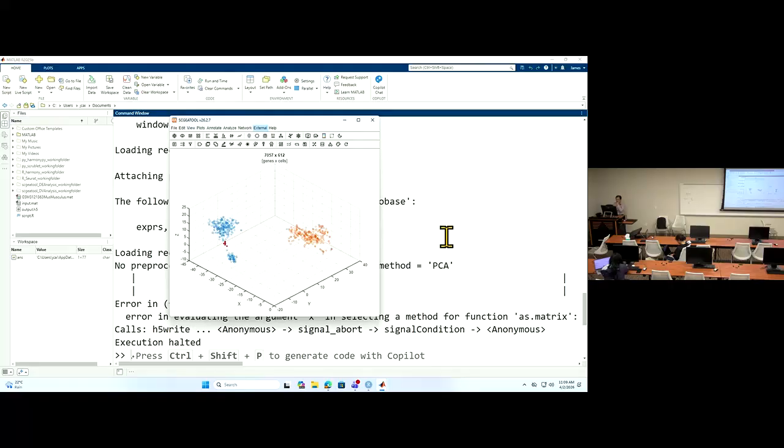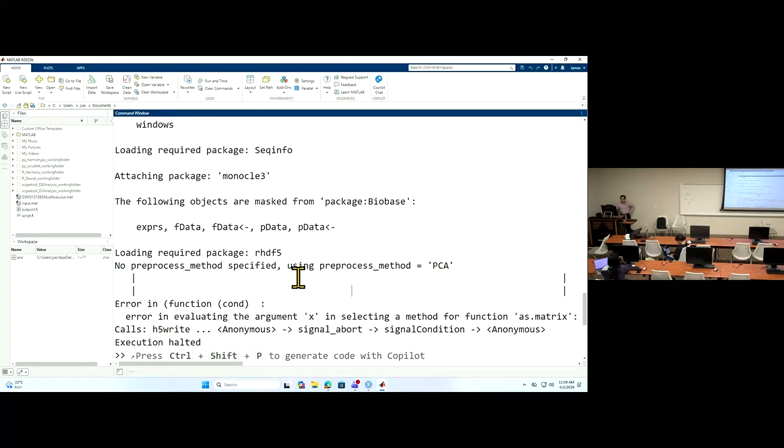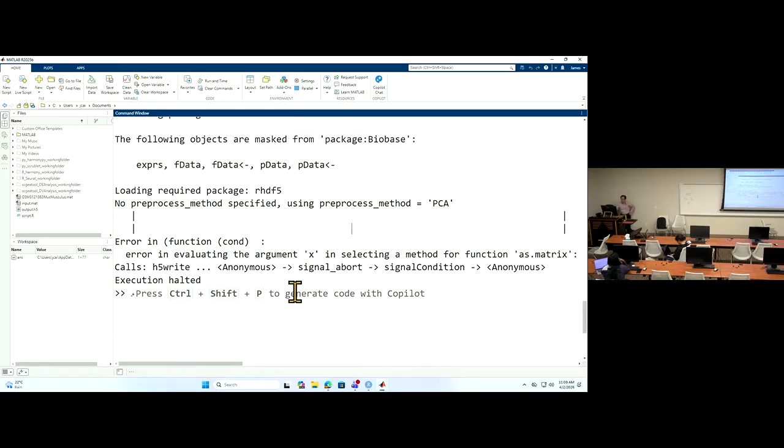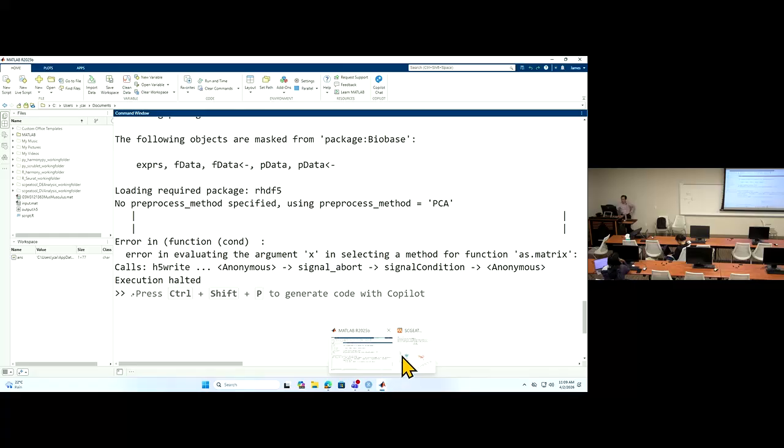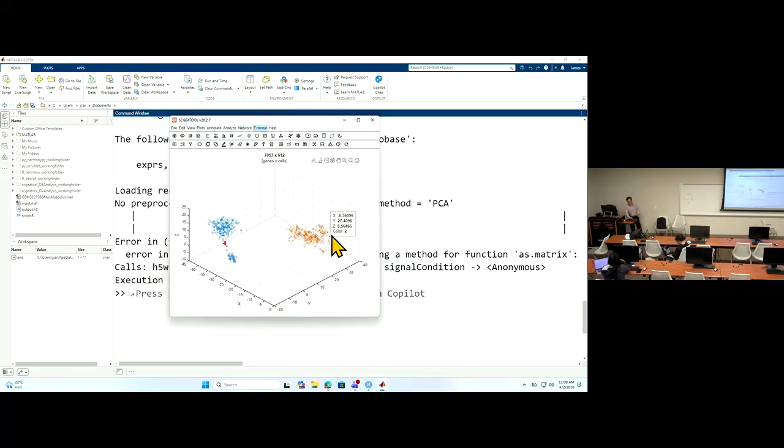It could be a problem, so we cannot run this for some reason. I do have a bug in the code. So I will try on my laptop, see if I can achieve anything. If not, I just have to go back and figure out what's going on, in which step we have this error message.